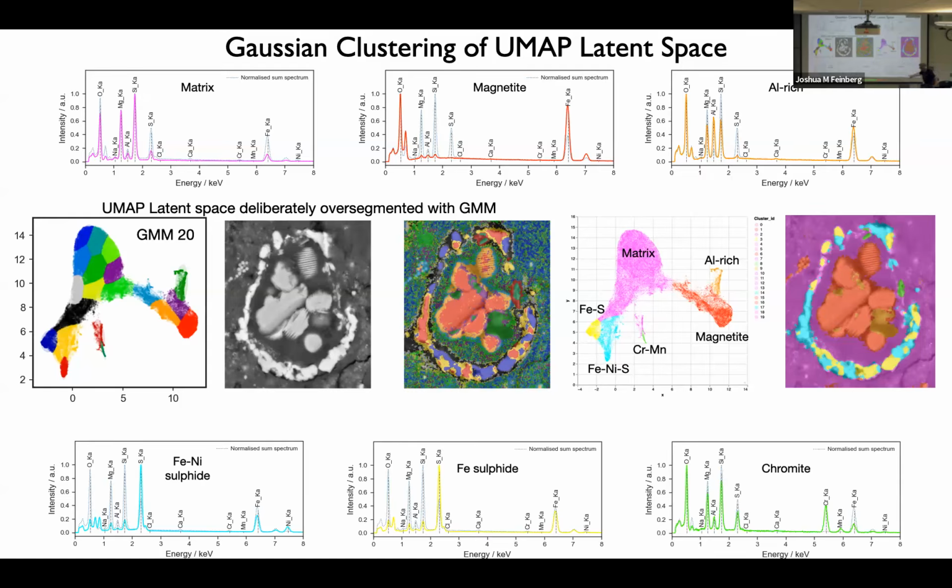So you've got chrome and manganese, but you can also see other elements here: silicon, magnesium, sulfur, iron. Because these chromite grains are very small, you're still getting mixtures from the matrix and that kind of thing. So this is not yet unmixed into the fundamental phases. That will be the next step.